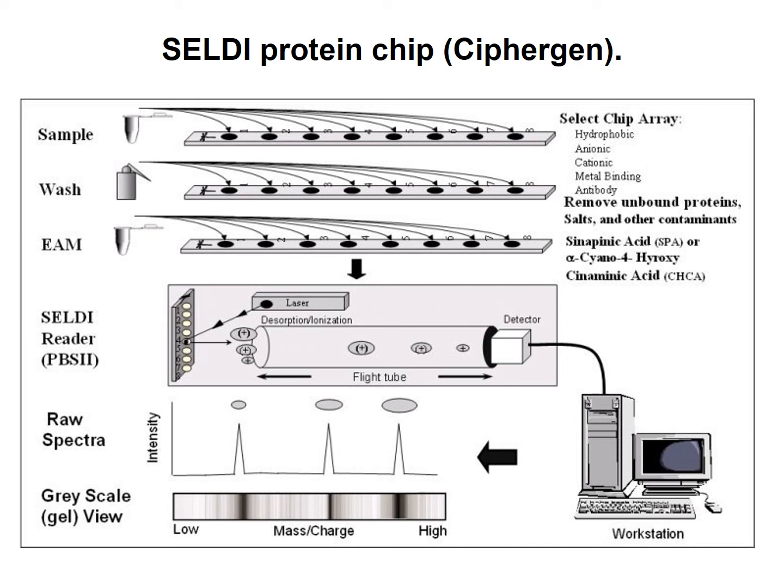So in cancer, what does the profile look like? Non-cancer, what does it look like? So differences will be detected right away. Of course, for informatics, all this information is stored and further patient sample can be compared.